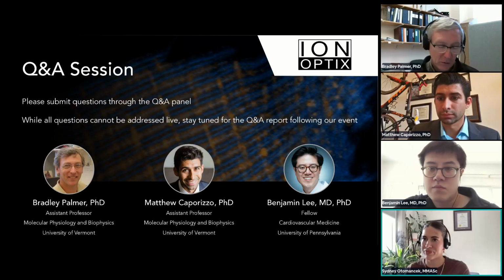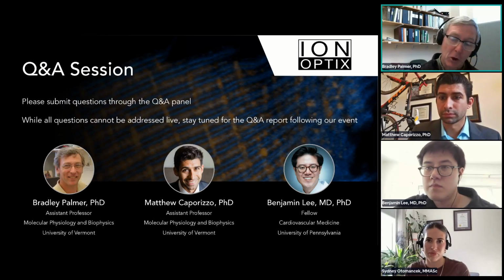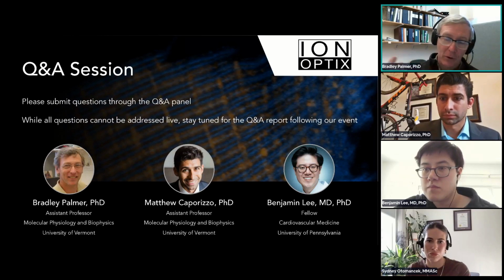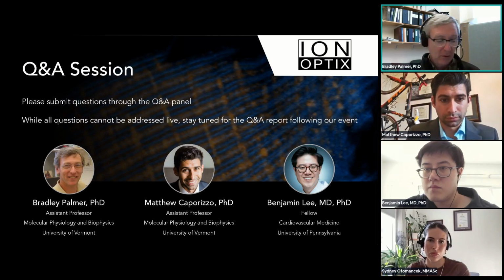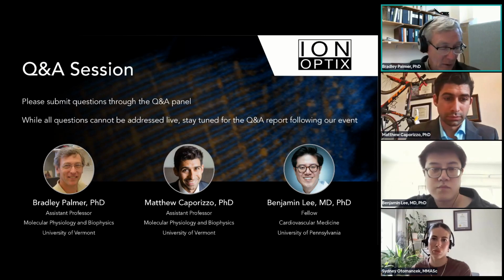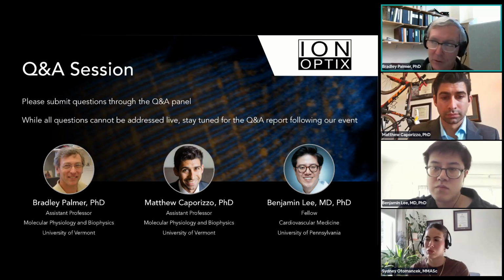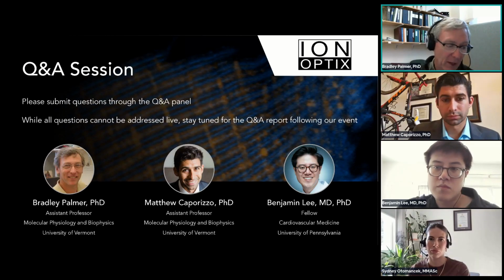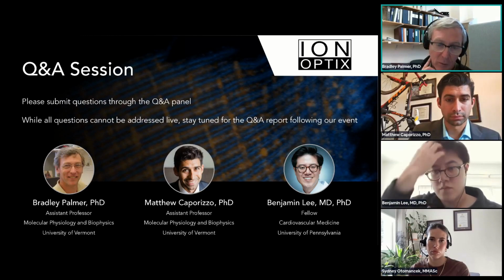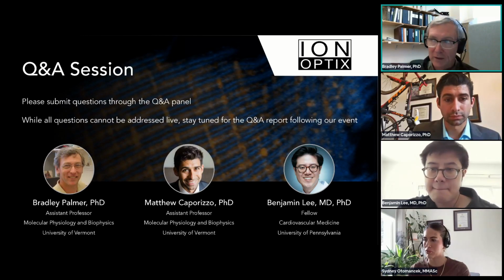If you don't mind, I'll take this question. That's a great question. We've been able to keep a cardiac slice on the microscope while collecting data for up to 36 hours. But we can keep it in the incubator for weeks. And we do intend to transfect, and we have had some luck, but not with the cardiac myocytes themselves. I think that was just because we were using the wrong vector. But we have been able to transfect fibroblasts. And there are other groups, particularly the Dendorfer group in Germany, that have had tremendous luck keeping slices in the incubator for weeks.